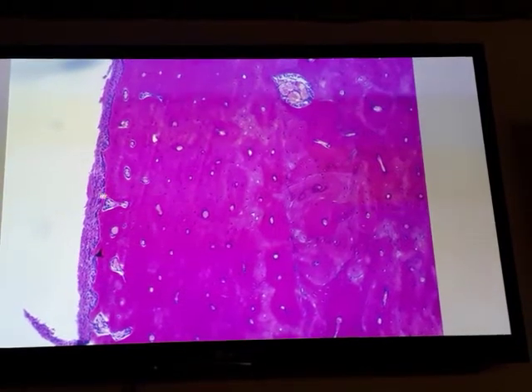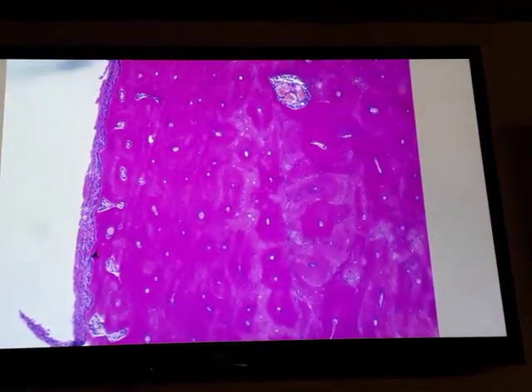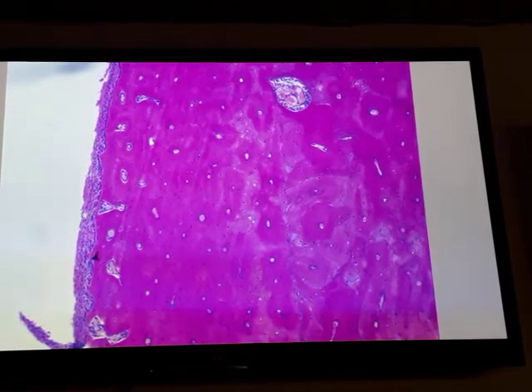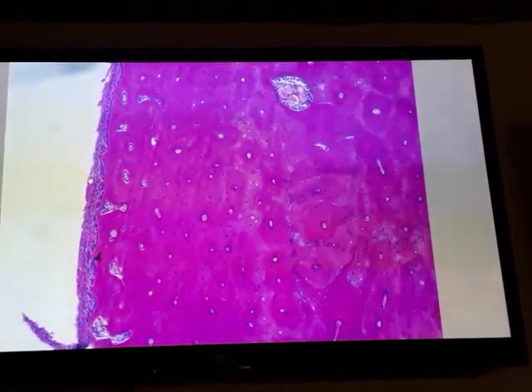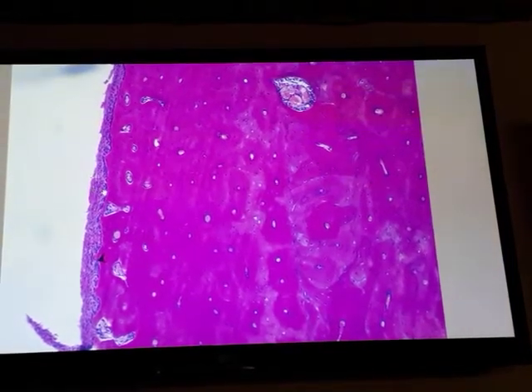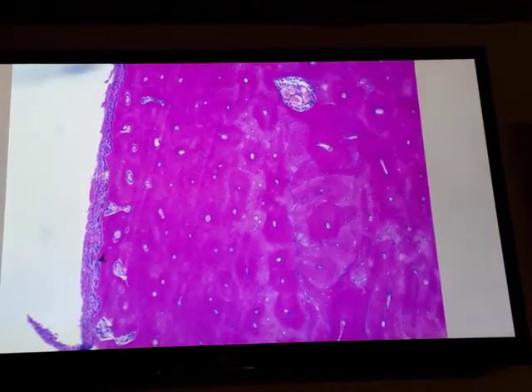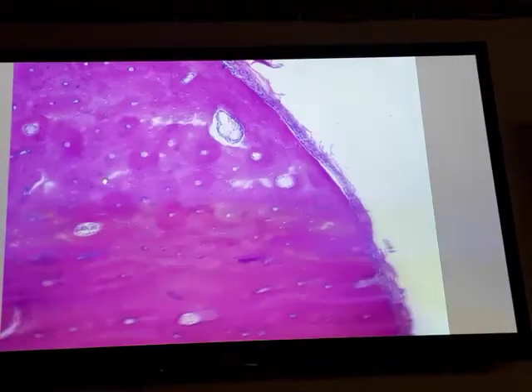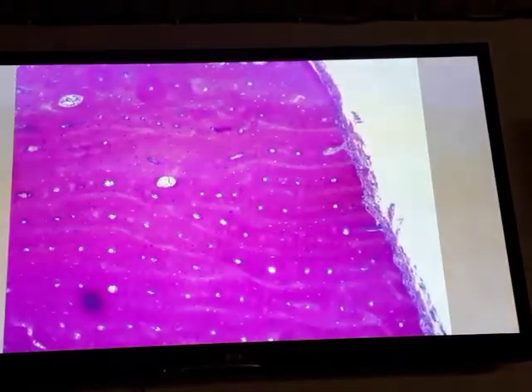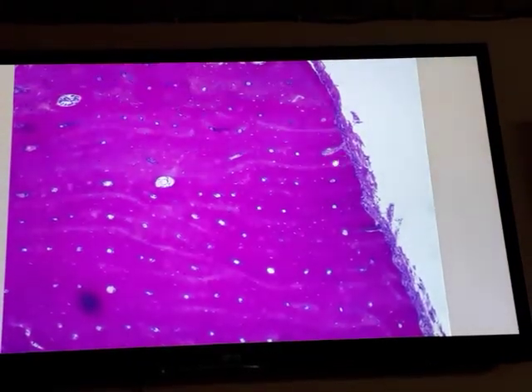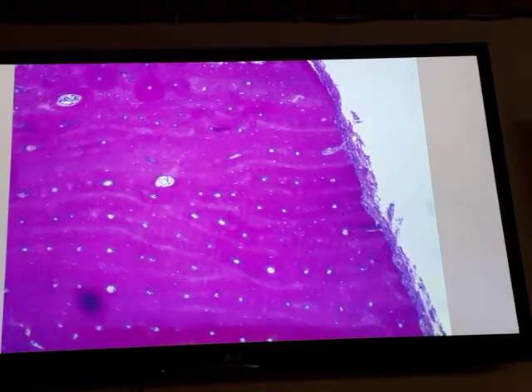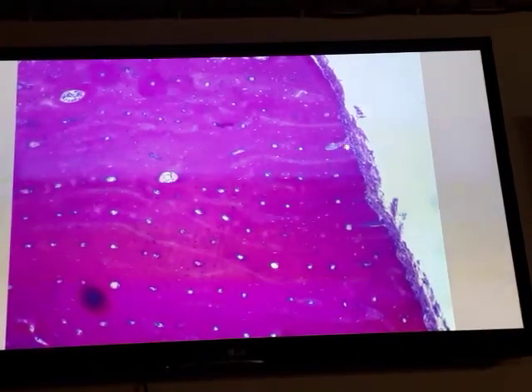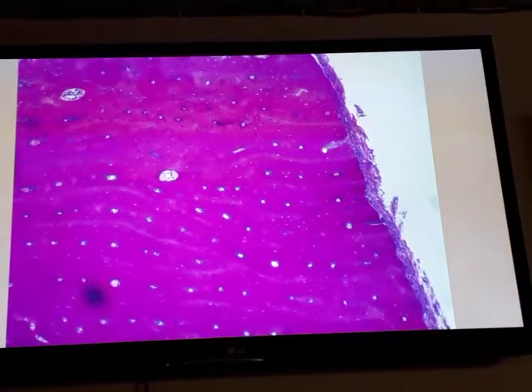In this section, we have periosteum on the external surface of the bone. Periosteum is composed of two layers: an outer layer of collagen fibers and fibroblasts, and an inner layer which is a single layer of osteoprogenitor cells. Collagen fibers extend from the periosteum into the bone matrix; these are called Sharpey's fibers.